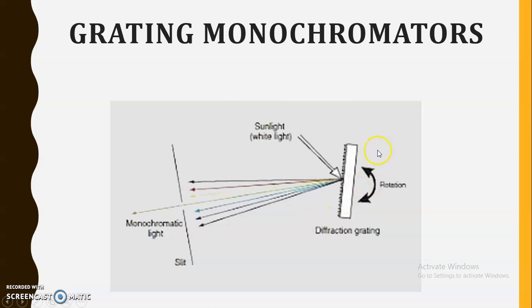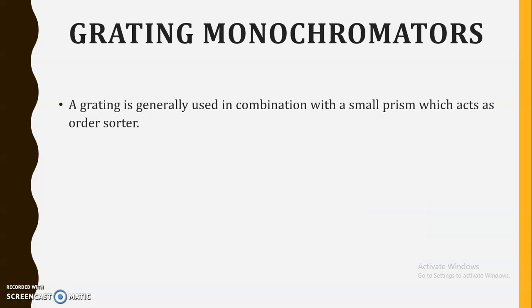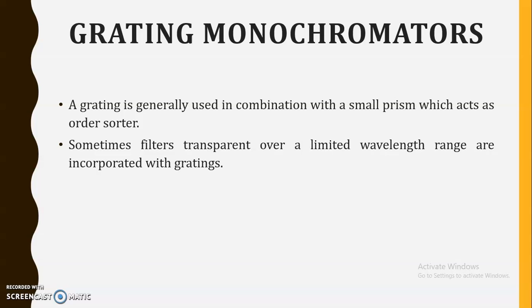As you see over here, this grating is continuously rotated and the slit is placed in front of this grating, so that when this light is separated into its individual components, only the light having a certain frequency will pass through this slit. So all the individual components are passed through due to rotation of the grating. That's why these gratings are known as diffraction gratings. A grating is generally used in combination with a small prism, which acts as an order sorter. Sometimes filters transparent over a limited wavelength range are incorporated with the gratings to increase their sensitivity. They are also used along with certain filters.